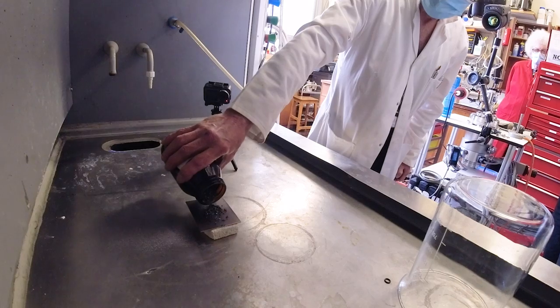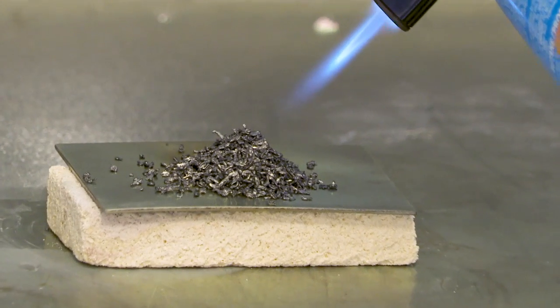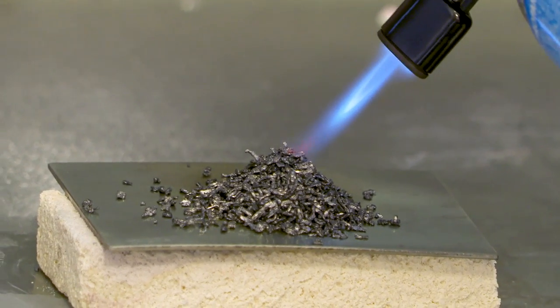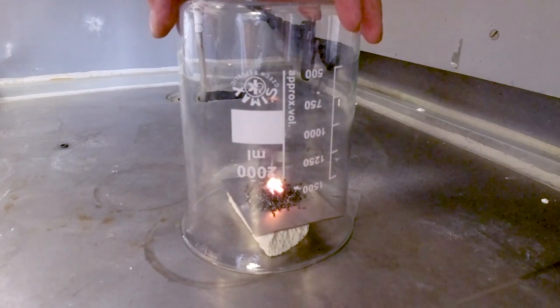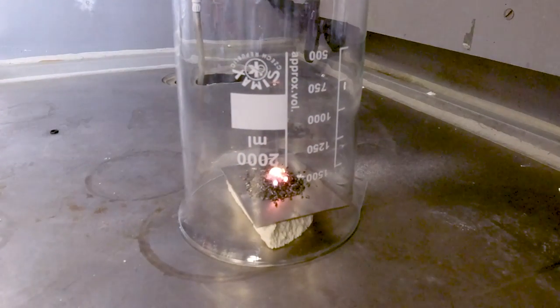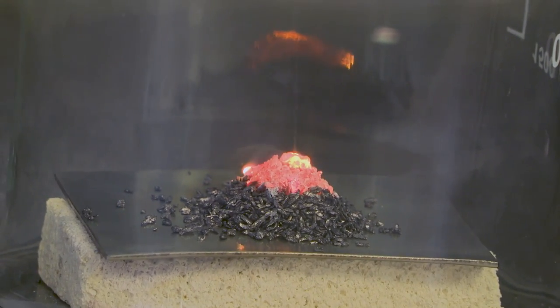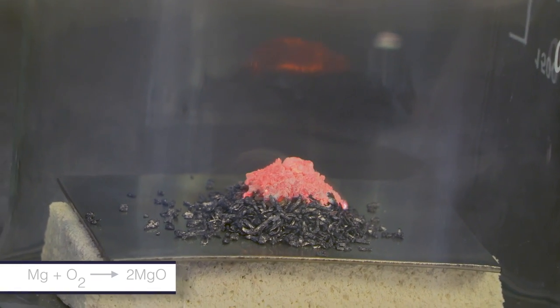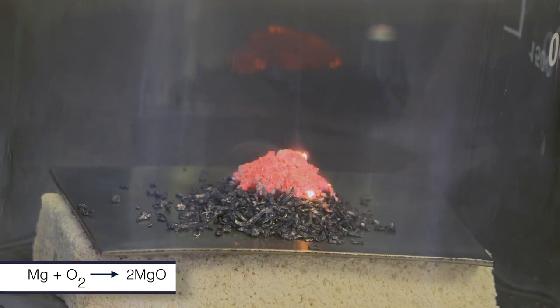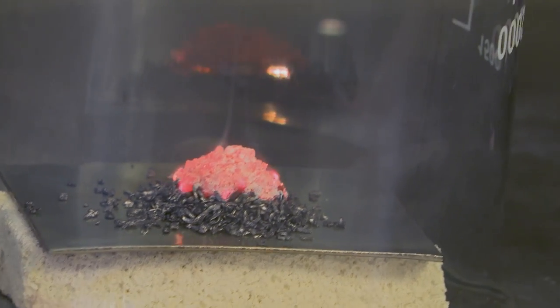The experiment consists of making a little pyramid of magnesium granules, setting fire to them in air so it begins to burn making magnesium oxide, and then taking a big beaker and putting it upside down over the magnesium which is already burning. Because the beaker contains air it continues to burn making magnesium oxide, but it uses up the oxygen inside the beaker so that the beaker just contains nitrogen.